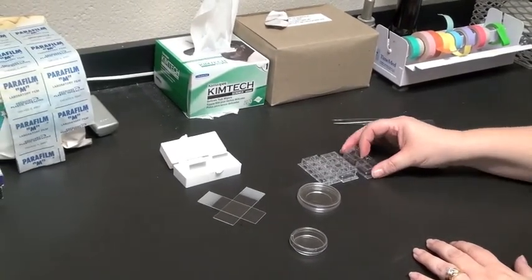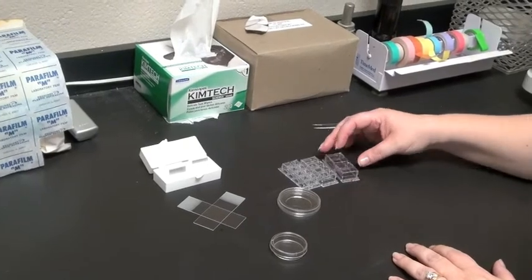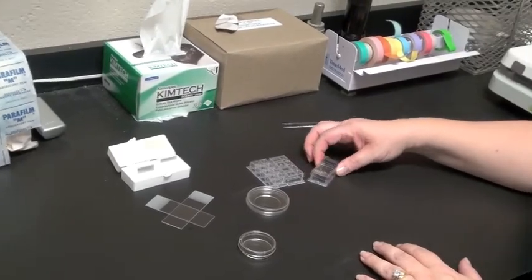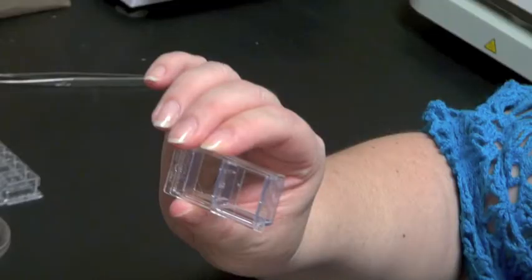If you're doing live cell work and you're going to be using an inverted microscope, you need to make sure that whatever container you choose has a cover glass bottom.